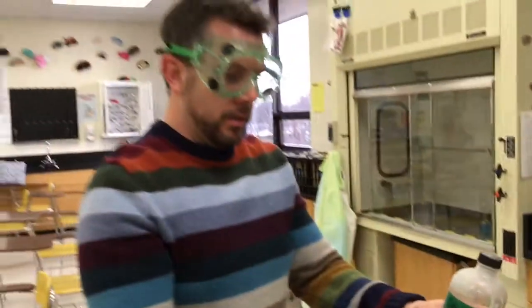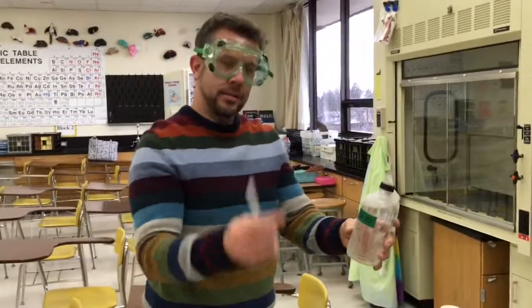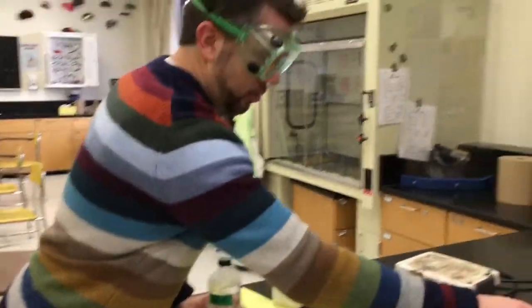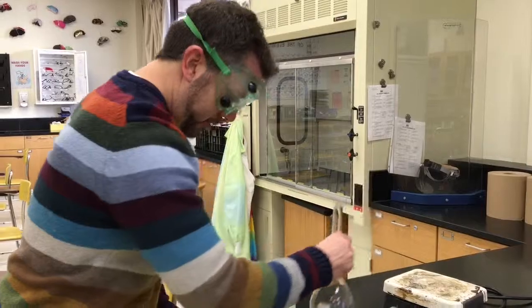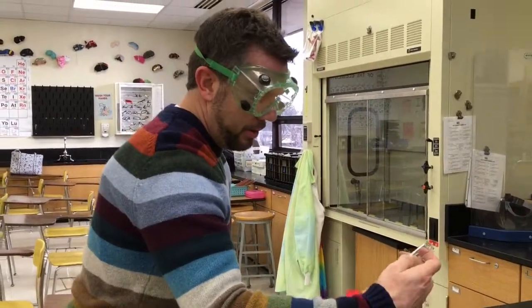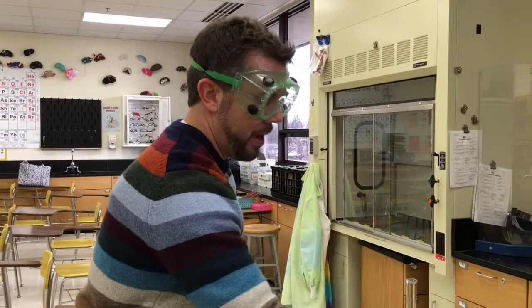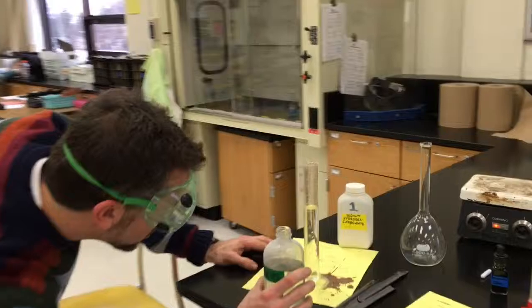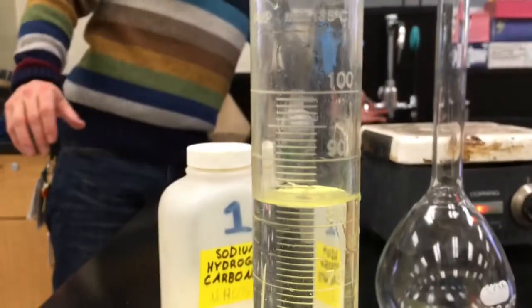So what does that mean? It means I have to take 83 milliliters of this, and then dilute it down with water so that it's not as strong. So I'll kind of show you what that looks like. So I got my 500 milliliter flask. I'm going to take my graduate. Unfortunately, I'm going to grab a bigger graduate, so I'll be right back. So hold on. Alright, so now let's double check that. I've got 83.3. You can verify that amount.